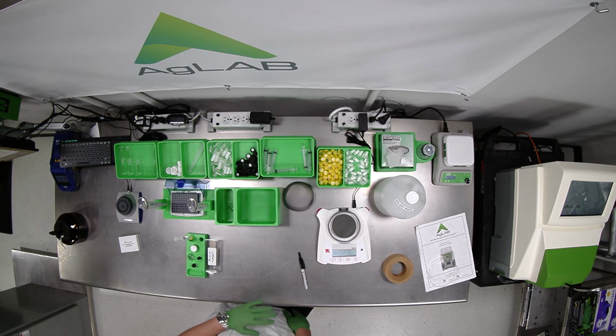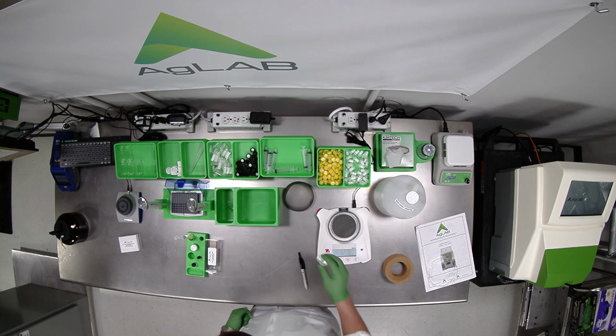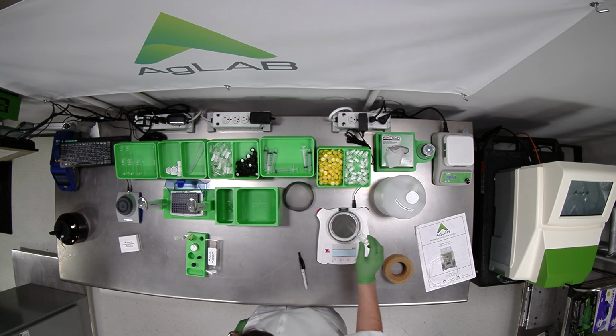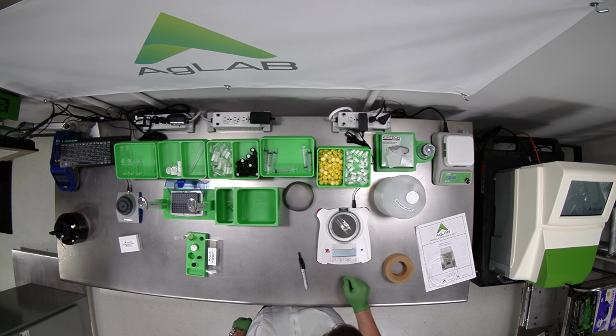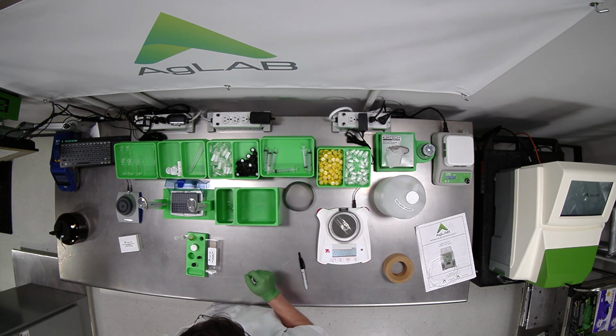All right, so our first step in the process is going to be weighing out our sample into our D1 vial. So I'm going to go ahead and tare that vial. Try to place it right in the middle. If it's not perfect, it's fine. But you do want to stay somewhat consistent between your tare and your actual mass measurement.